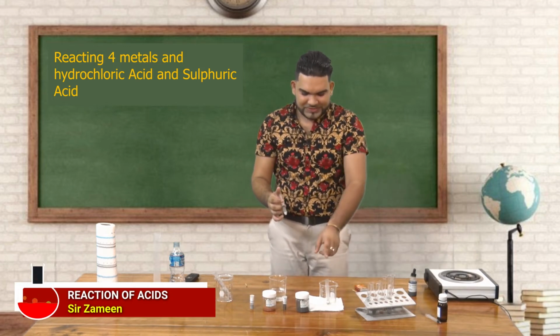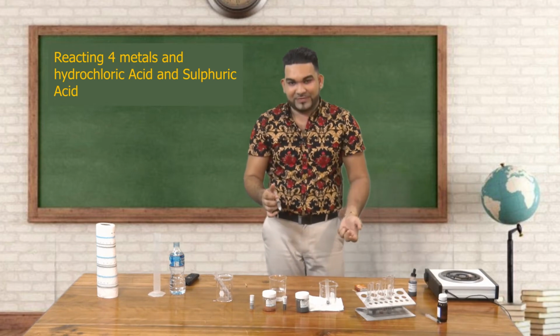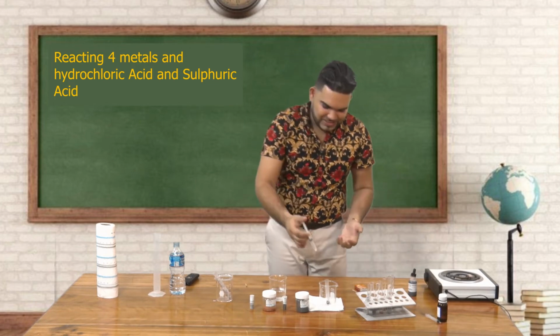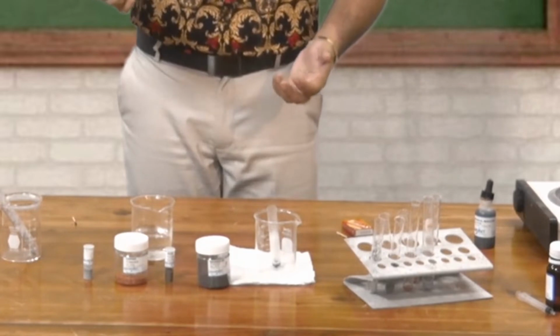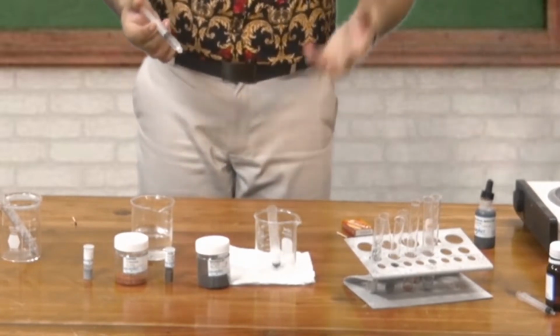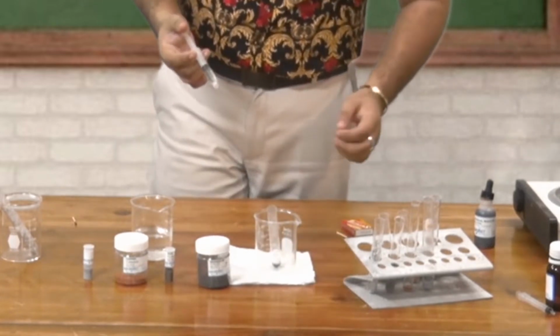Whoa. As you can see, I don't know if you can actually see it, but you can actually see the gas being evolved. Right, now of course if we add a little bit more, look at that. Right, so imagine now if we would actually light that match, it would be poof, or pop I should say rather, a huge popping sound would occur.